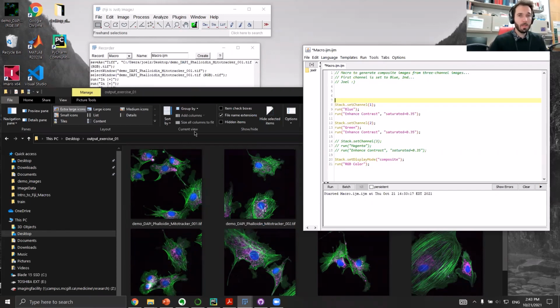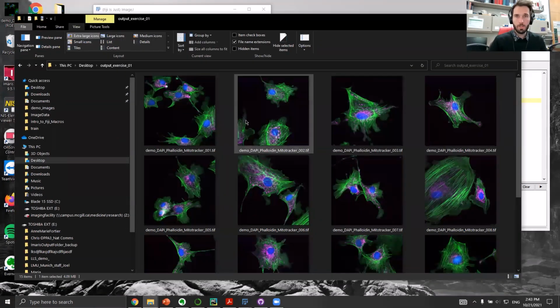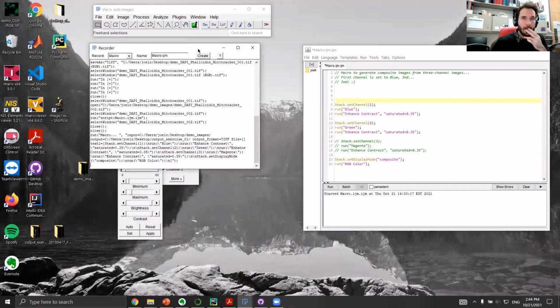Okay. Are there any further questions, or did things not work for people? Right. It looks okay for now. So I hope this was helpful. This was exercise 1. Hopefully you can get an idea, a feel for how these things work out.